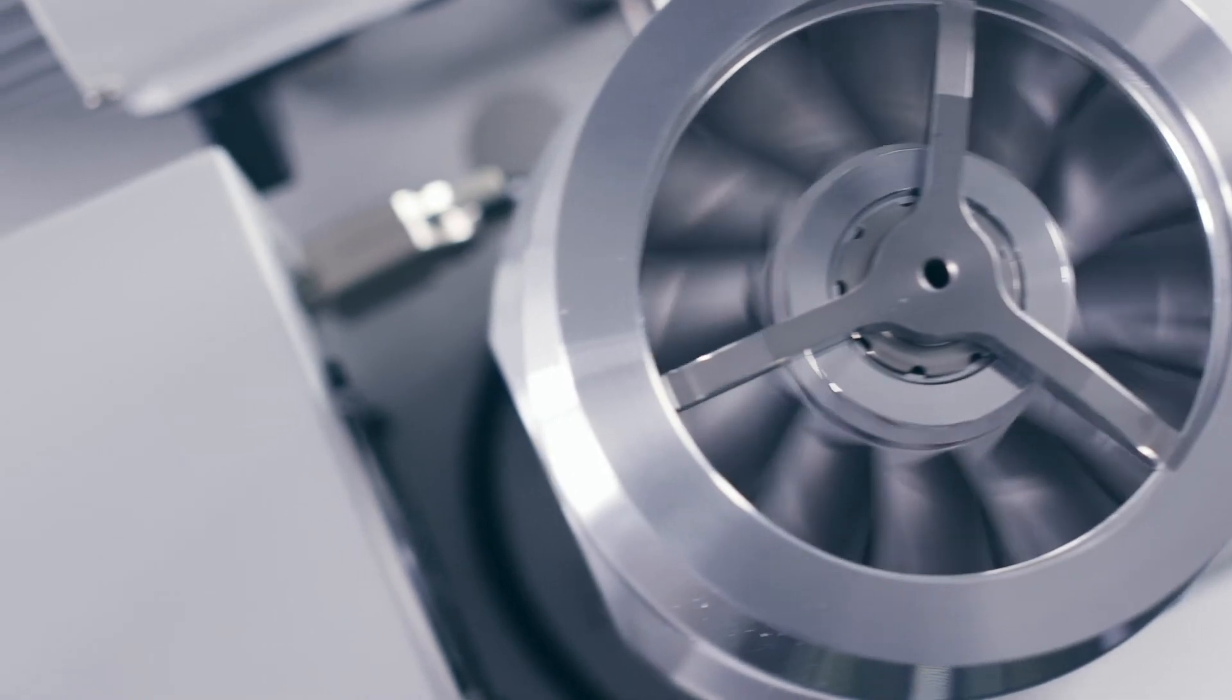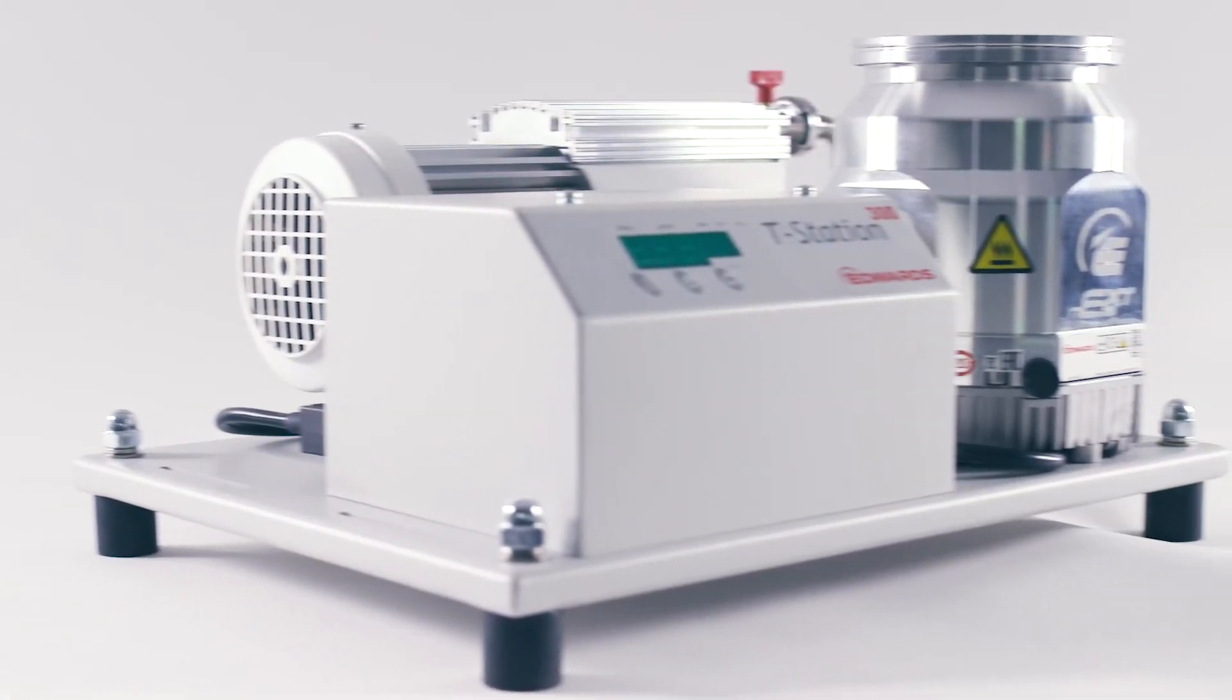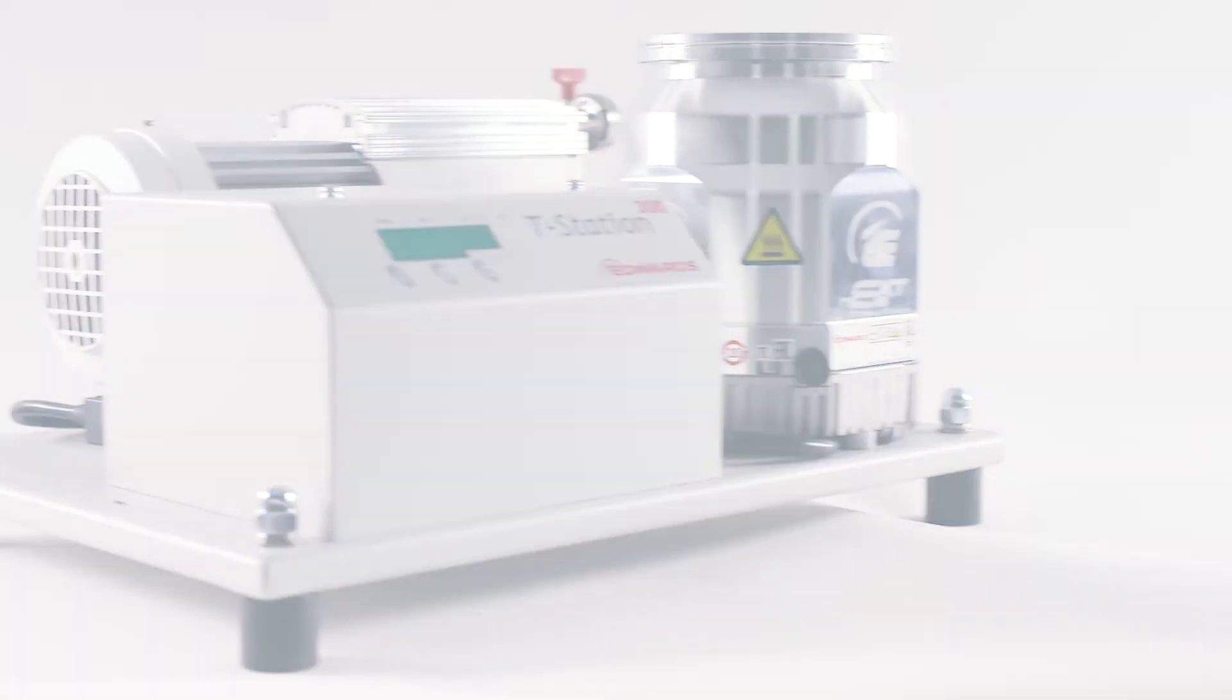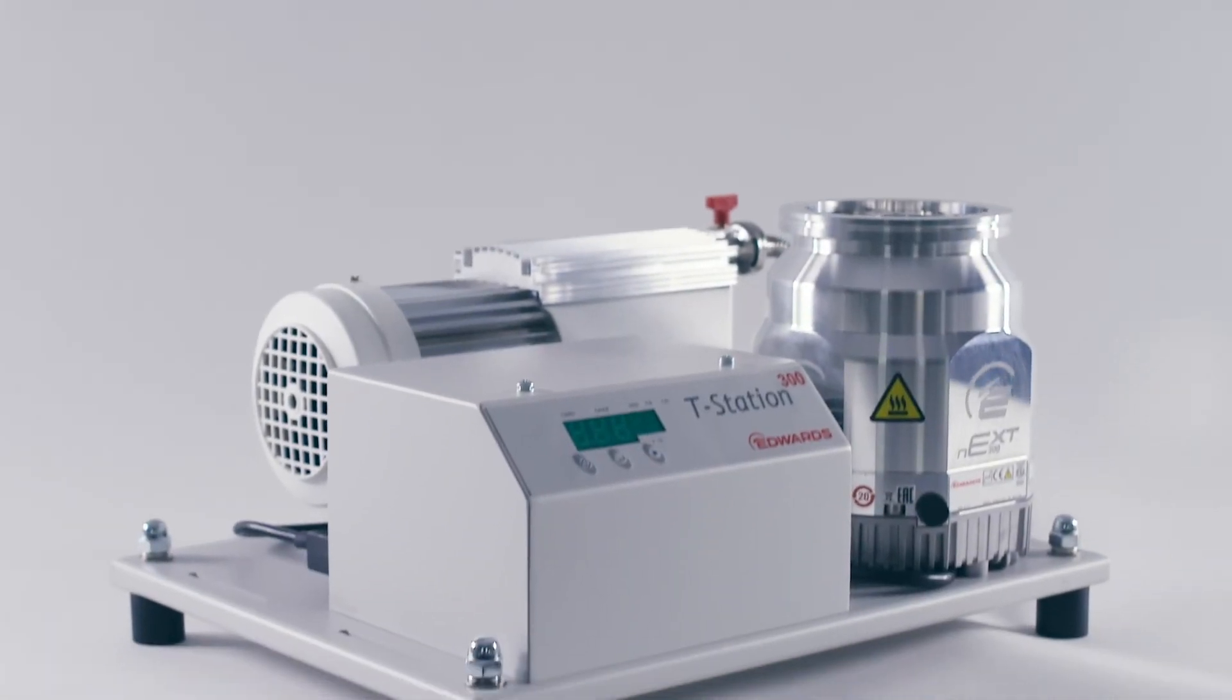The Edwards T-Station 300 turbo molecular pumping station extends our portfolio to provide a solution for customers who have applications that require higher pumping speeds. I'm David Goodwin and this is the Edwards T-Station 300.